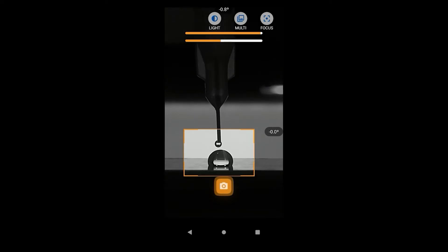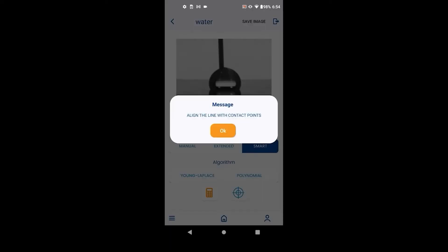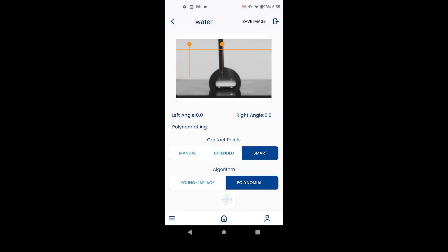Generate a test droplet to help calibrate the image settings. The camera focus should be on the droplet, not the surface edge or the needle. Hit the capture button once you are satisfied with the settings. The polynomial algorithm can measure left and right contact angles separately, and the needle can be inside or outside the droplet.